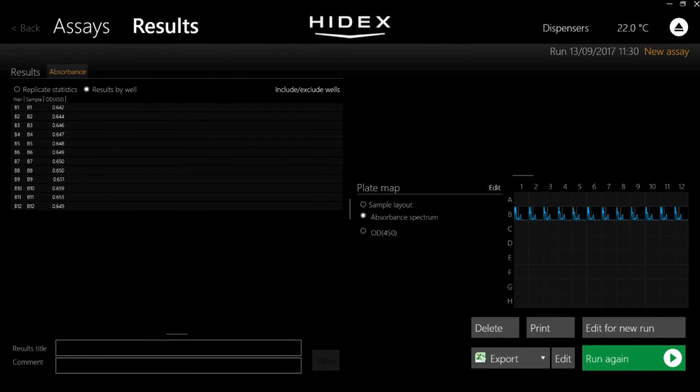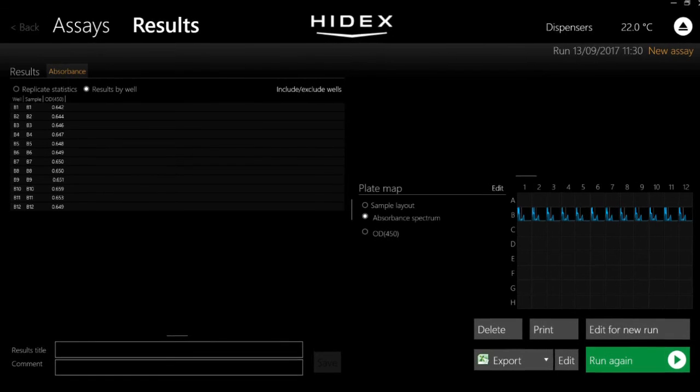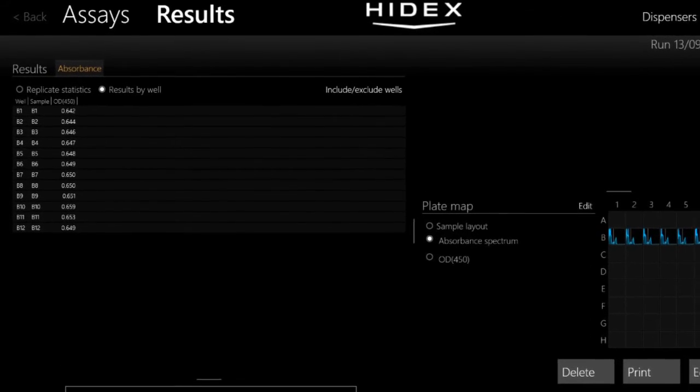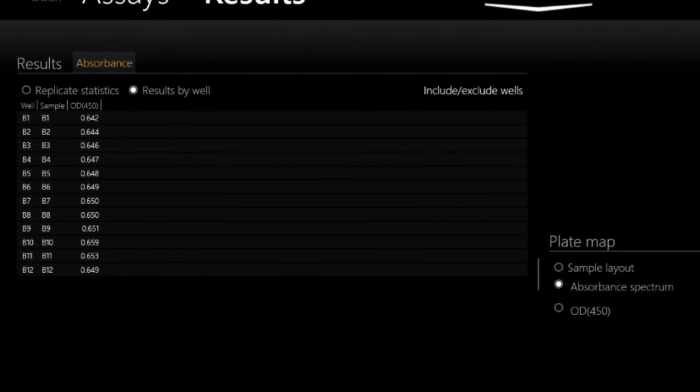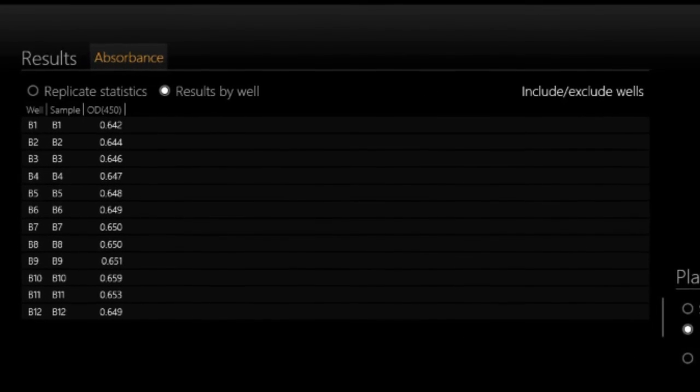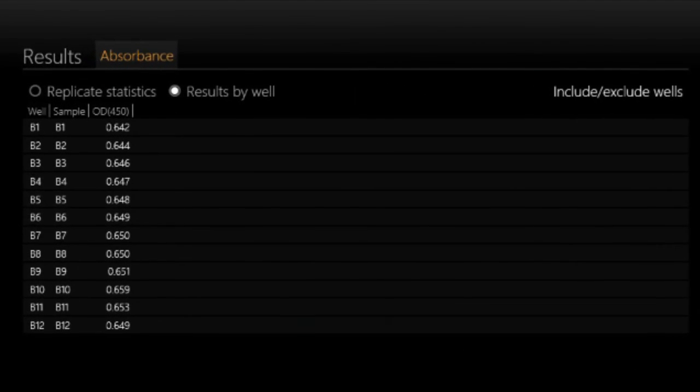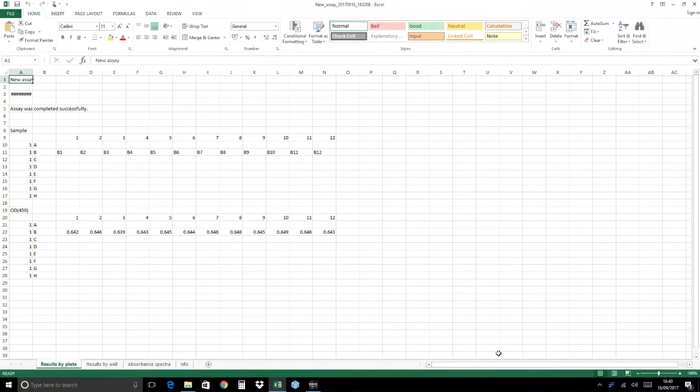With the HydexSense's intuitive software being application focused, the user can easily access the full spectrum data set. This can then either be exported in full or at the optimum wavelength to be further analyzed.